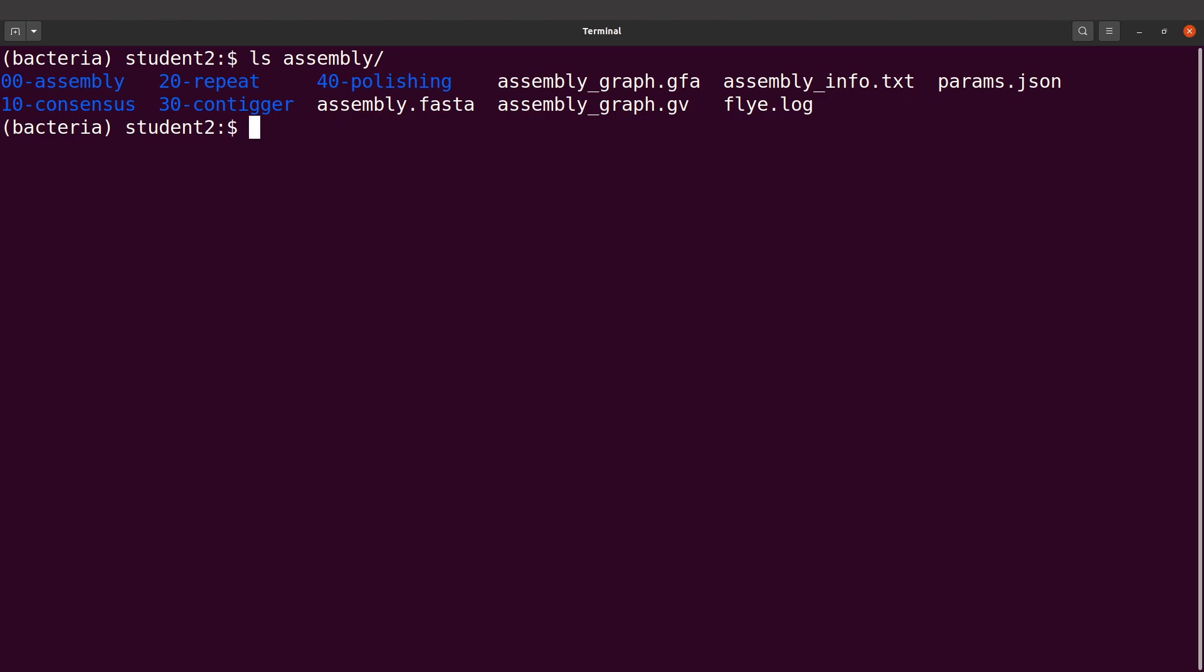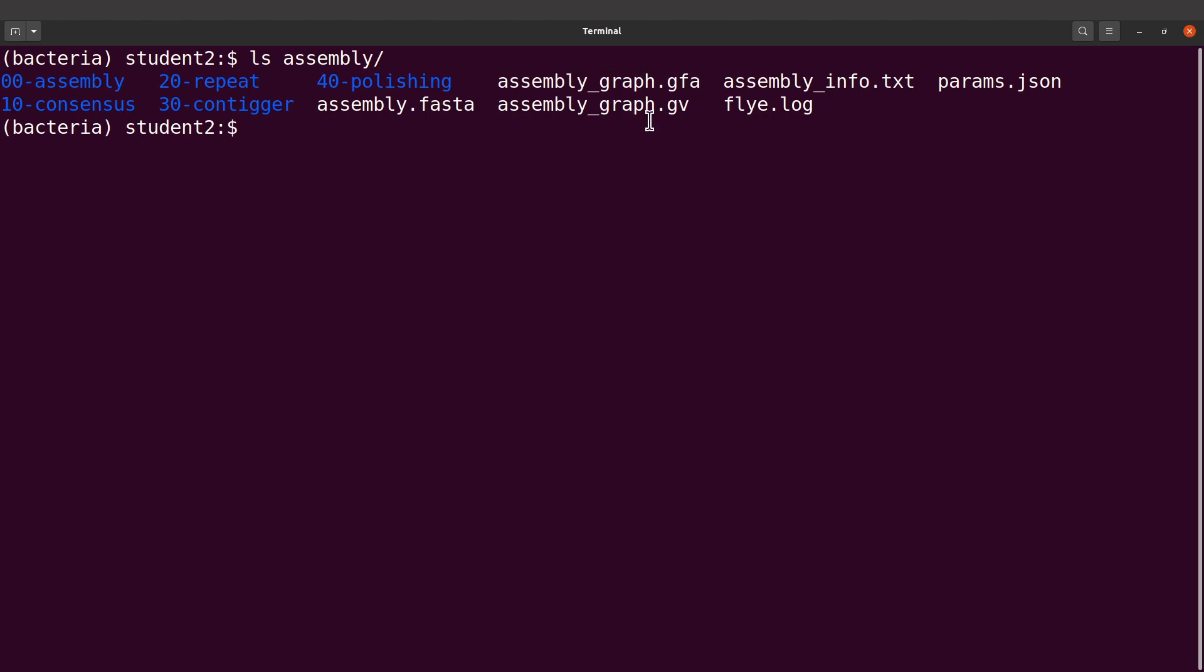We are now going to visualize the assembly by using this assembly graph here. To visualize using Bandage, we have to first call Bandage. If you installed Bandage using mamba or conda or micromamba, you call it like this and then execute the command. So let's execute this command.